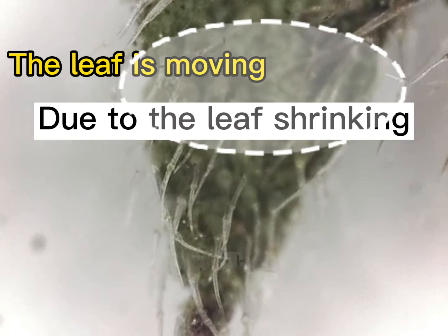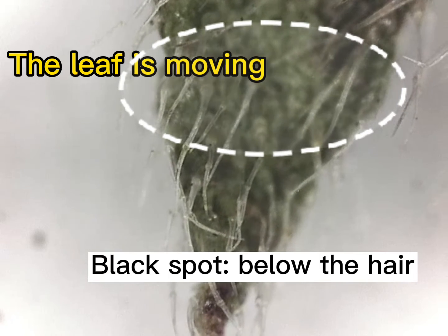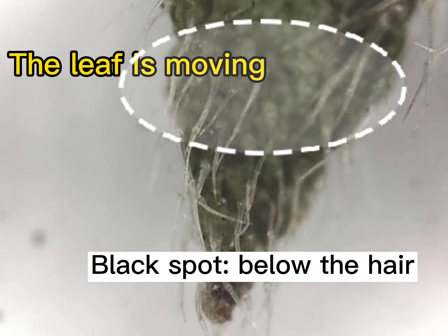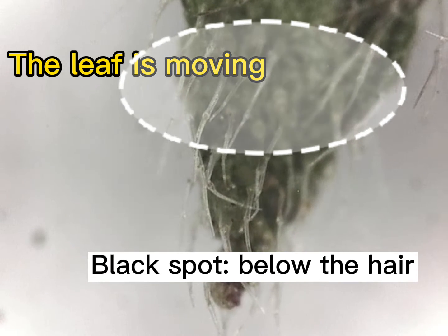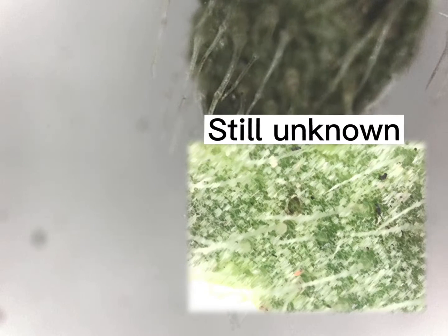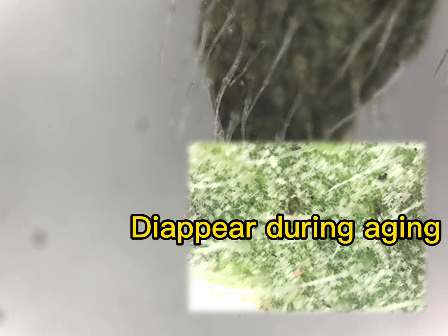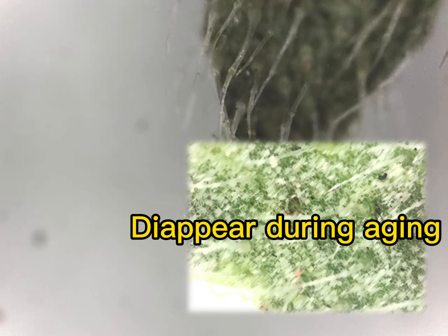At the same time, the black spots on the surface of leaves observed under low magnification might be the bottoms of leaf hairs, which were more obvious and no longer emerald green. The white spots on the leaf surface were still unrecognizable at this magnification, but they almost disappeared when the aging time was greater than 20 hours.